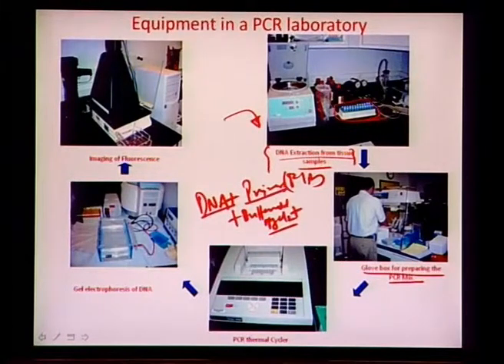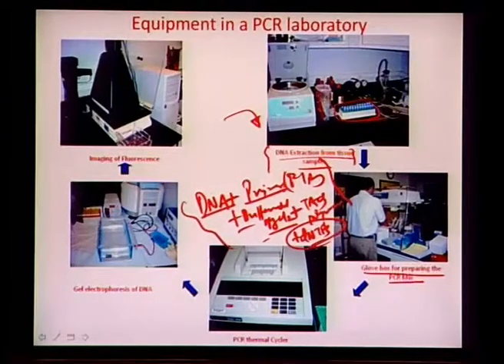You also give the Taq polymerase, the enzyme which does the amplification, and the dNTPs, which provide the independent A, C, T and G bases as the DNA is expanded through this chemical process of amplification.